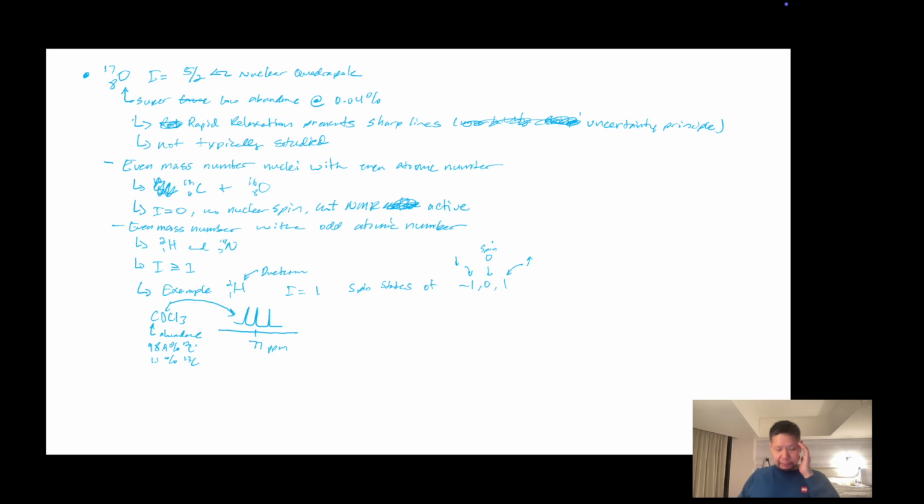When we're doing proton NMR, you're at 0 to the low teens ppm. But the triplet peak here of the deuterated chloroform is at 77 ppm. So deuteriums are NMR active, just not in the same area of chemical shifts as the protons.